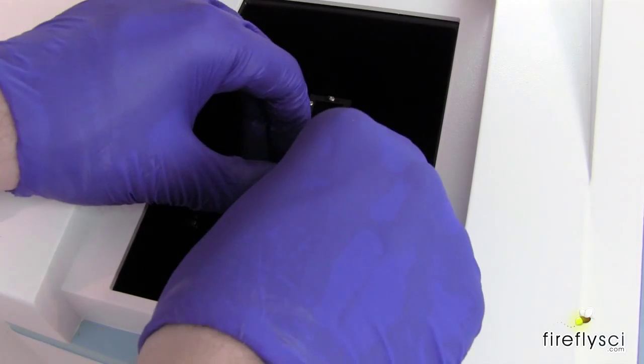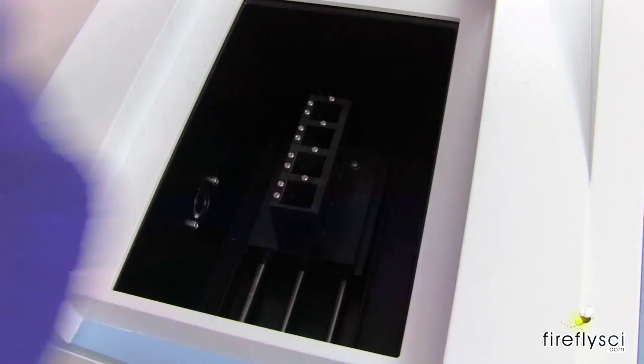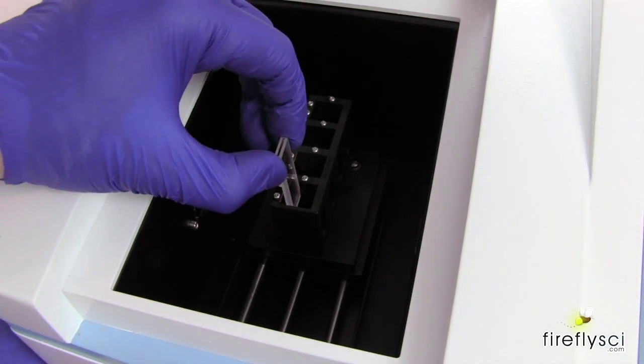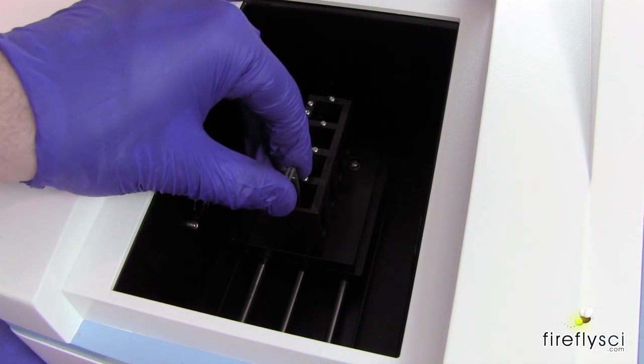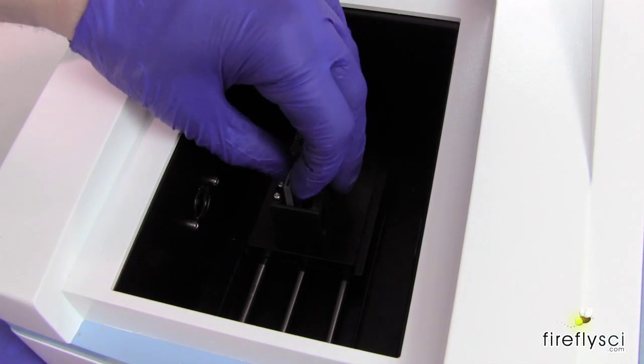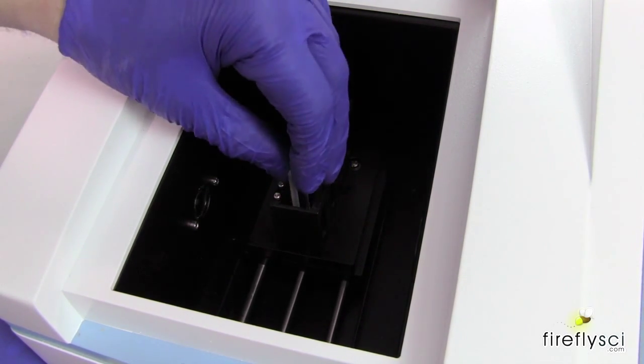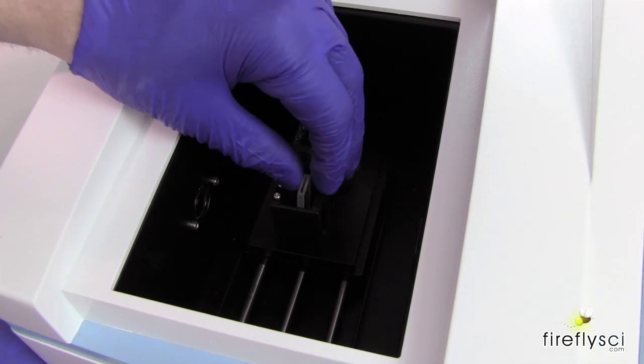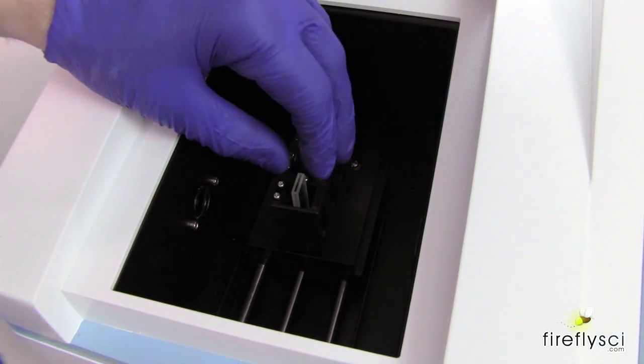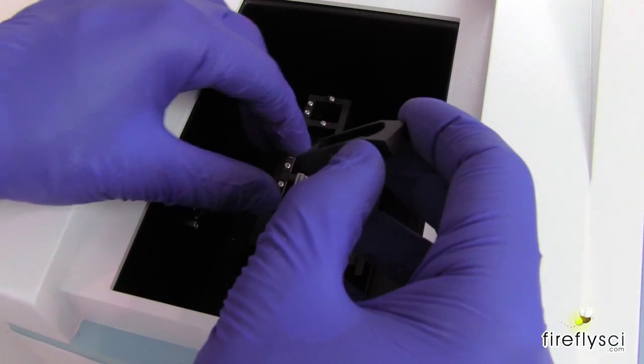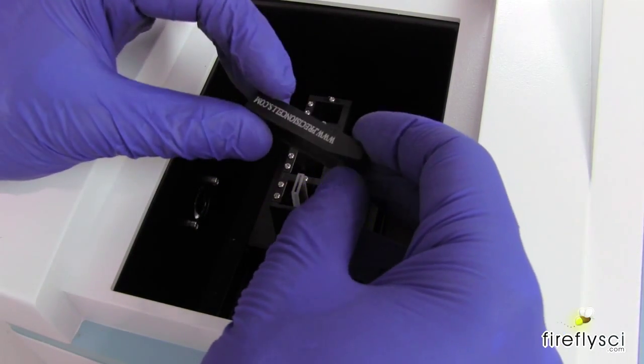If we didn't have the spacer, then it's not so simple to make sure that this is flat up against the holder, or it could tip over. So to make sure that you get it 90 degrees and get it perfect, it's best to get one of these spacers, and use one of these spacers, or use the A20 cell mount.